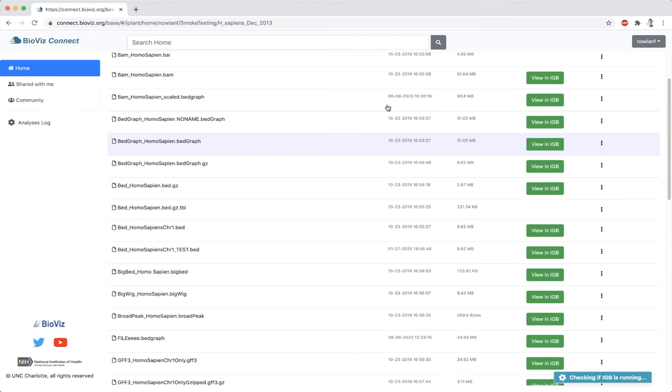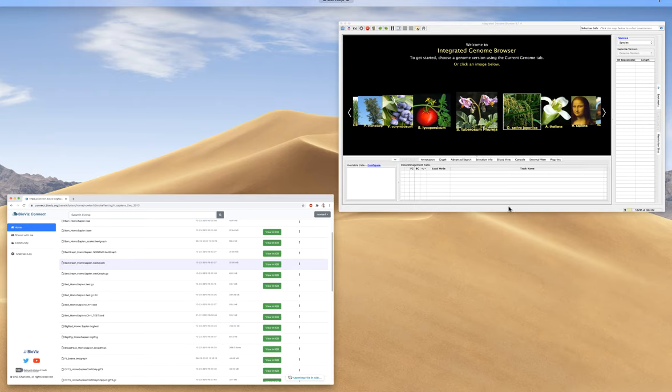Note that when a file is public, anyone with the URL or link to the file can access it.